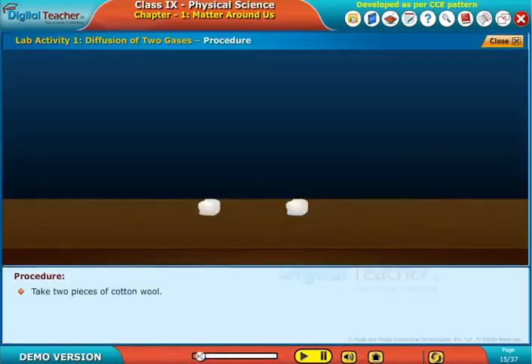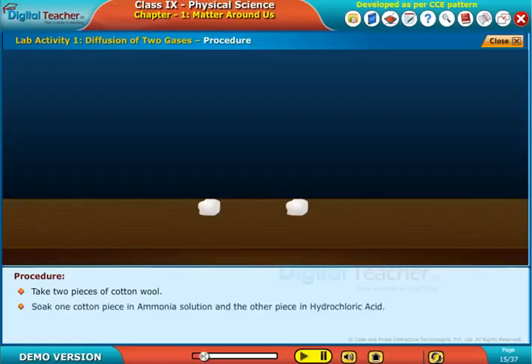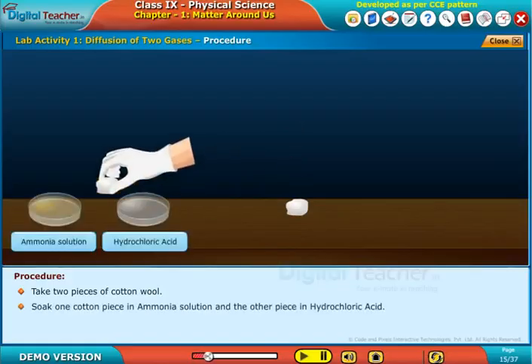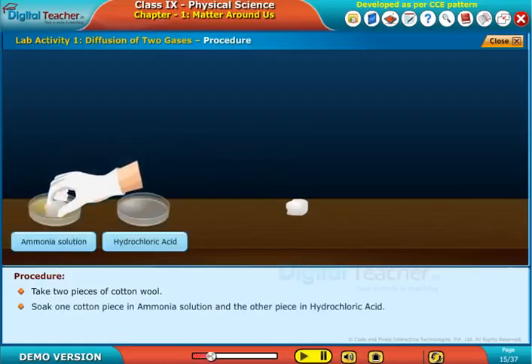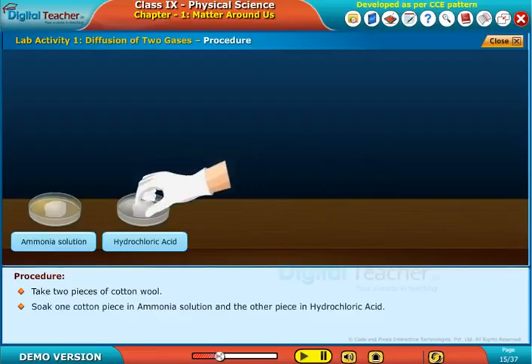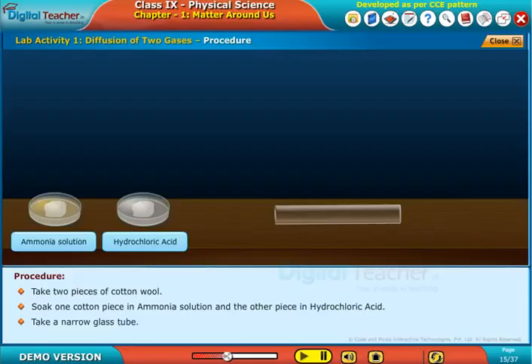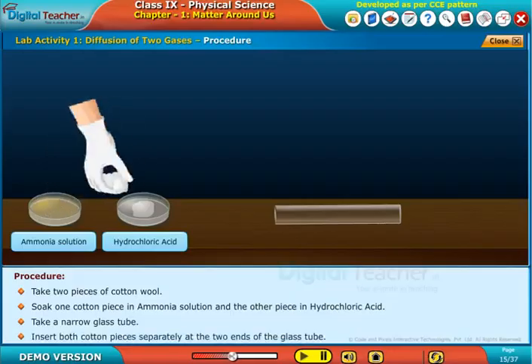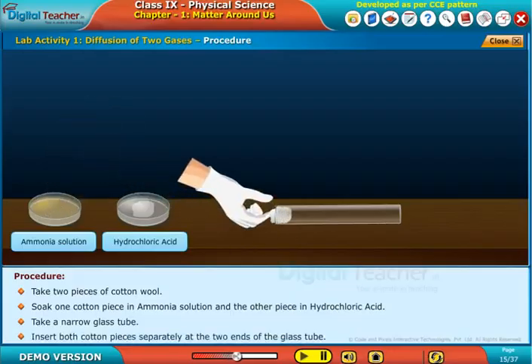Take two pieces of cotton wool. Soak one cotton piece in ammonia solution and the other piece in hydrochloric acid. Take a narrow glass tube. Insert both cotton pieces separately at the two ends of the glass tube.